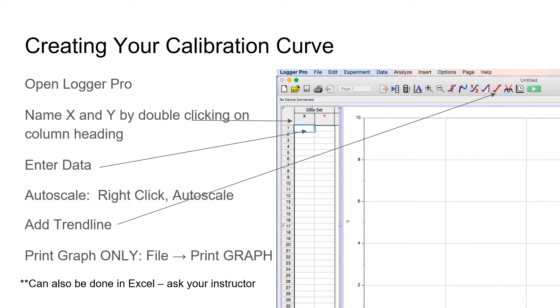To create a calibration curve in Logger Pro, you'll fill out the x values and the y values on the left side of the screen that's shown there. Once you have your data in, it'll plot it for you on the right side. You can right click and say auto scale and that will make the dimensions right. Then you can add a trend line with that button shown with the third arrow, and that will create the line that you saw in the graph in the previous slides. That will help you determine your percent sugar in your unknown solutions. You can save that graph and upload it to your lab.